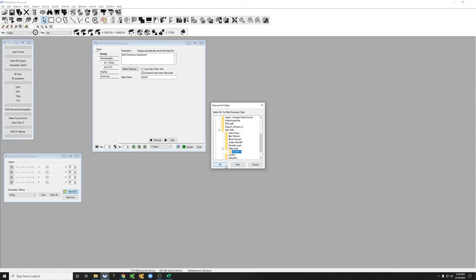That'll keep your data more organized, and we'll discuss how your data structure looks later once we've acquired some images. But just take my word for it that it's good to organize it in folders for now. I'm going to say okay.